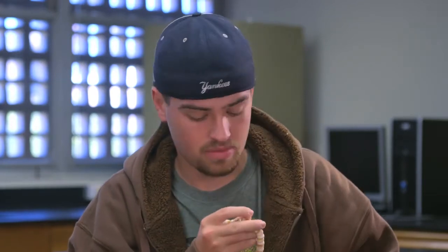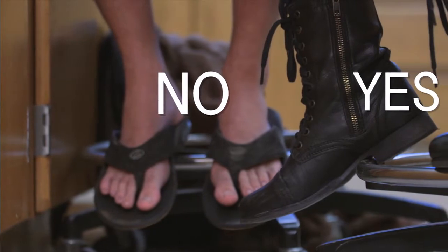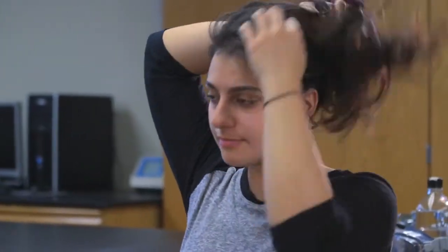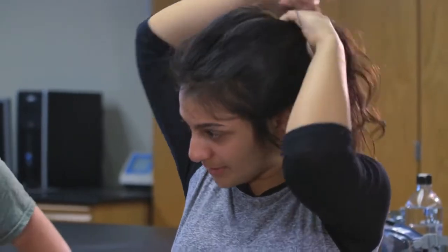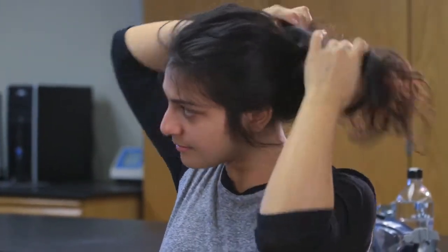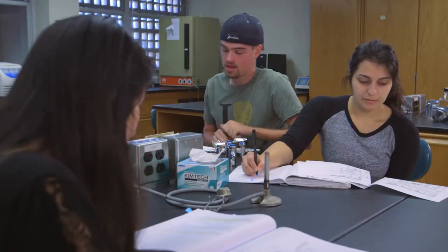Consider wearing appropriate clothing and shoes before you come to the lab. Try to avoid long necklaces, bulky clothes, and highly flammable materials. To protect your feet from spills and sharp objects, you should always wear closed-toed shoes. Students with long hair should be prepared to tuck it away or put it up during laboratories, especially those involving open flames.